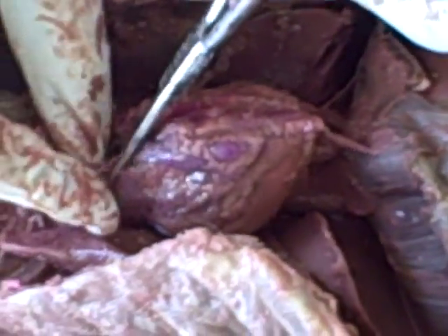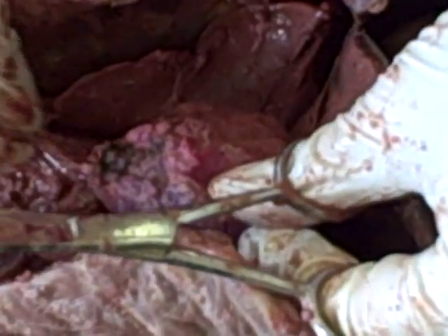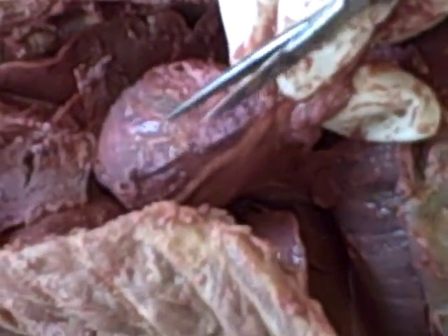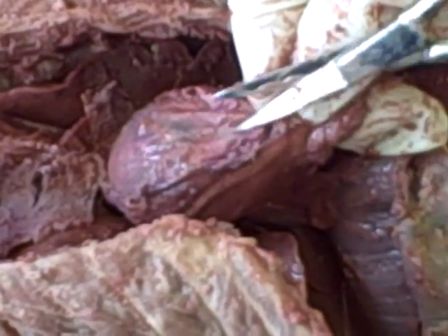Let's see if I can get some of the tissue off of it. Serous tissue helps separate and protect the organs from rubbing against each other. Every time this contracts, you don't want it to rub against the previous organ. So there's a sac here. You can see this tissue running along the organ. I'm going to cut it.